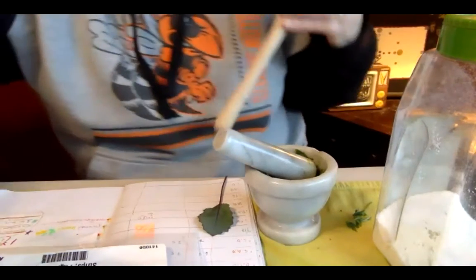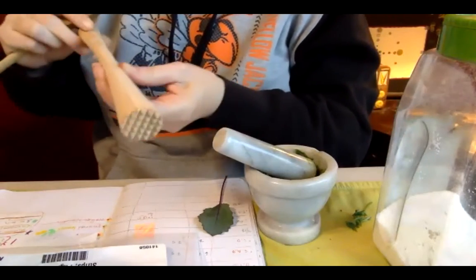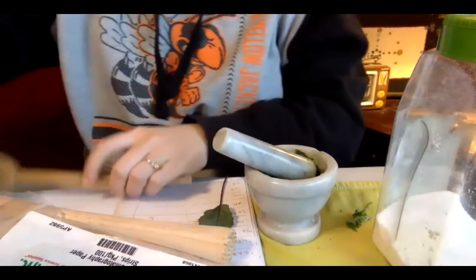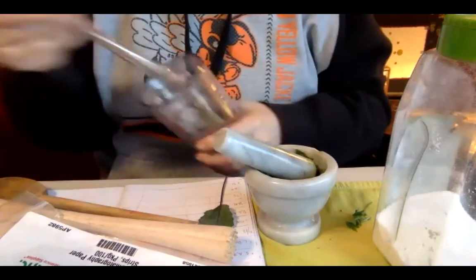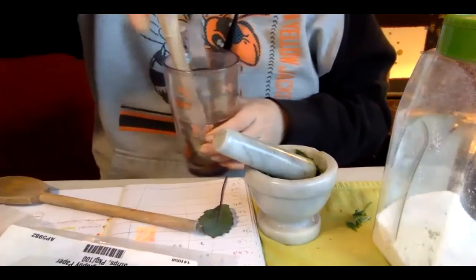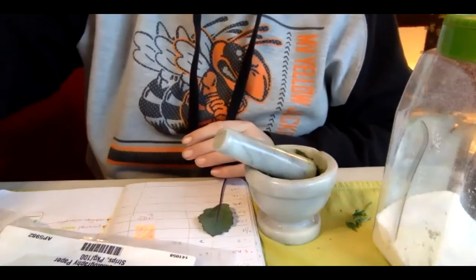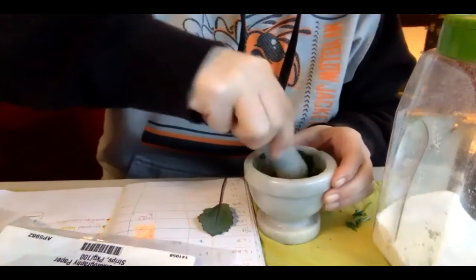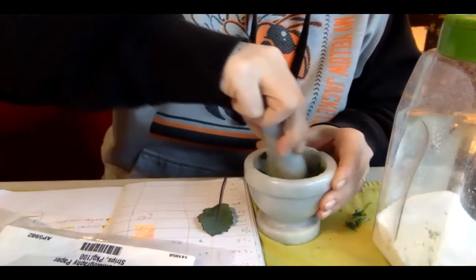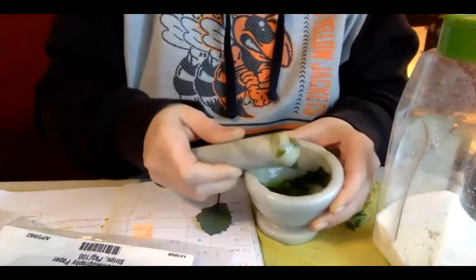With it, kind of like any wooden handled thing. I have a muddler. This end of a wooden spoon, just in the bottom of a cup, even a blunt end of a butter knife. You're just going after the organelles that hold onto the pigment molecules, and we want to break those organelles down. So I got to get into the cell wall. Anything that'll rip and tear. And the salt is helping be abrasive. See, it's already getting pretty green.